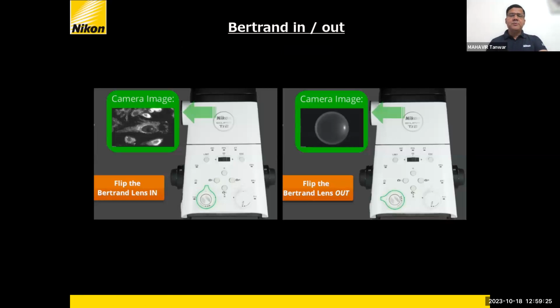Secondly, the microscopes are built in such a way that they are not just for standard usage. These days, microscopes are also being used by many people, especially in IITs, who are developing something of their own optically. So they definitely need a back focal plane image on the screen to check and confirm whether the laser is perfectly getting aligned or not.